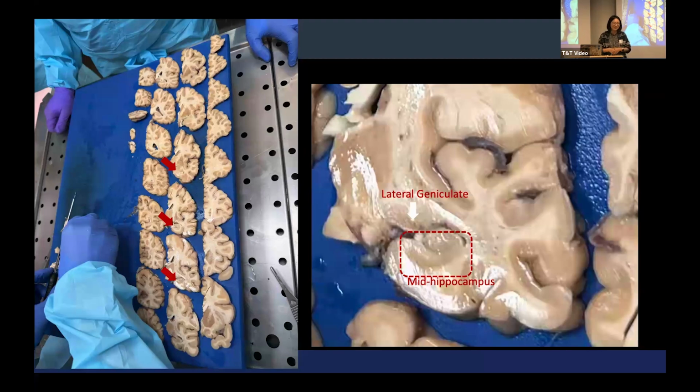So sequencing-wise, it's at least 400 times more expensive than a mouse brain, and the brain is 3D, so not just one plane, but three planes. People estimate it takes at least $8 million just to sequence spatial data for one human brain, and it's not even single-cell level. So scale-wise, it's difficult, and there are dedicated teams.